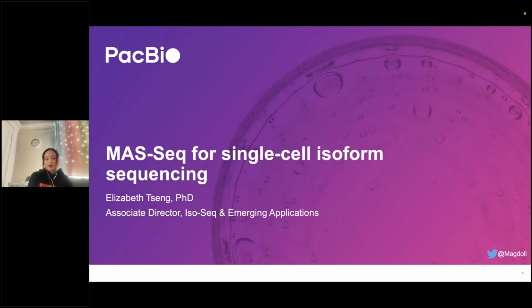Welcome to the MAS-Seq webinar. Today, I'm going to give you the introduction to the MAS-Seq for single-cell isoform sequencing. And for the remainder of the talk, I will be off camera.